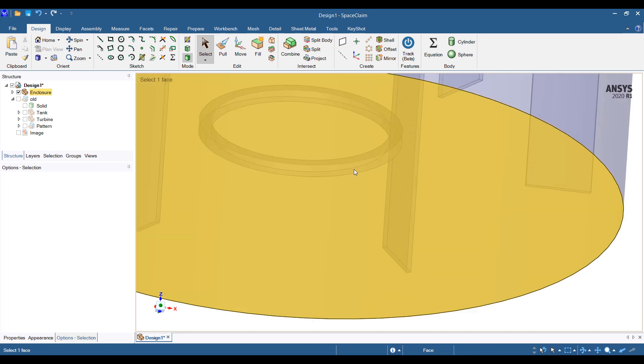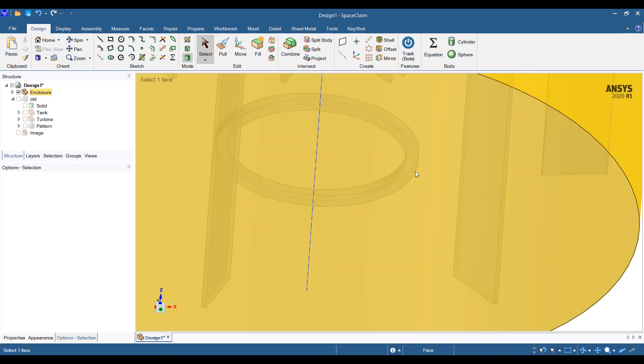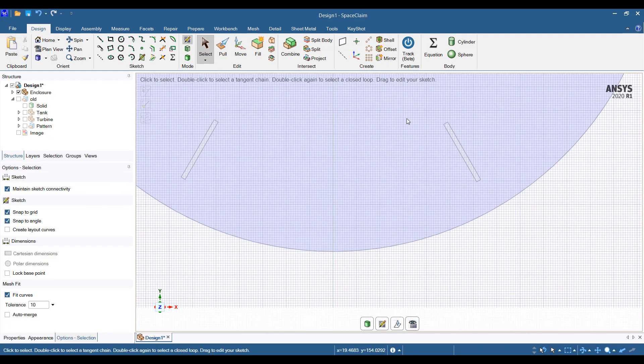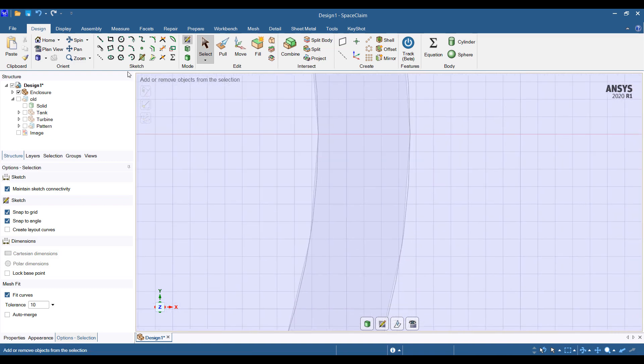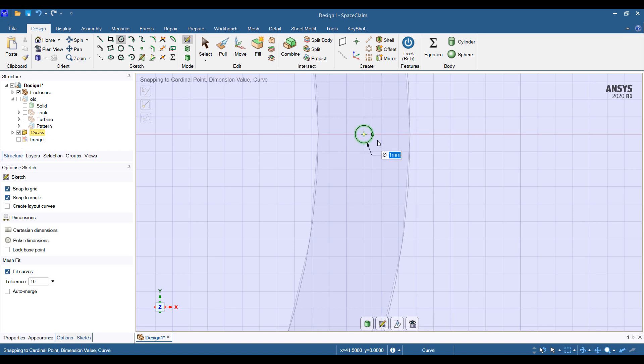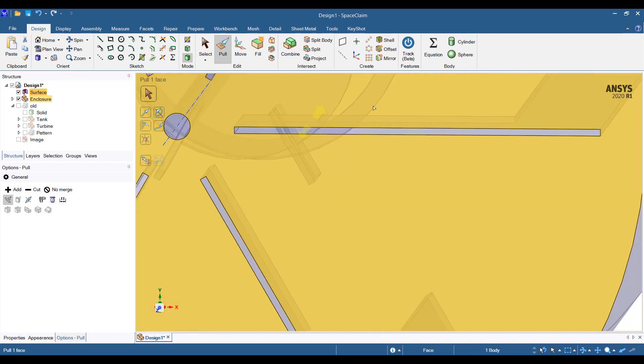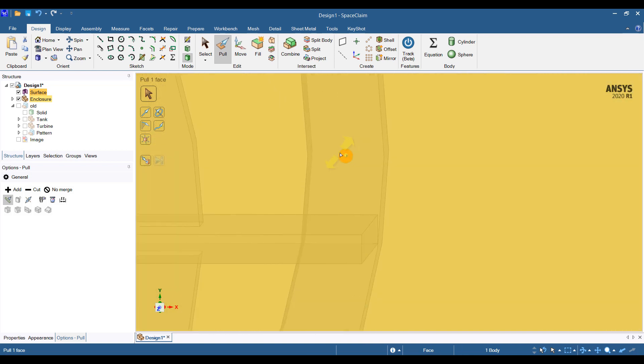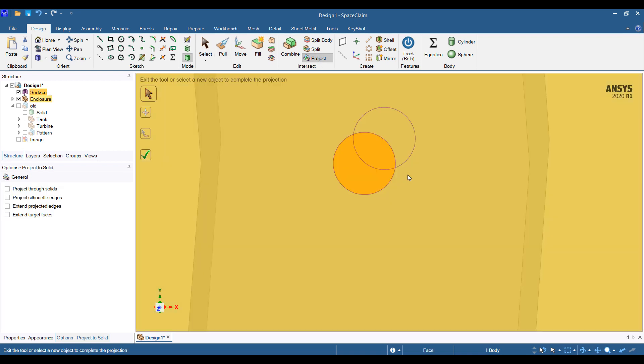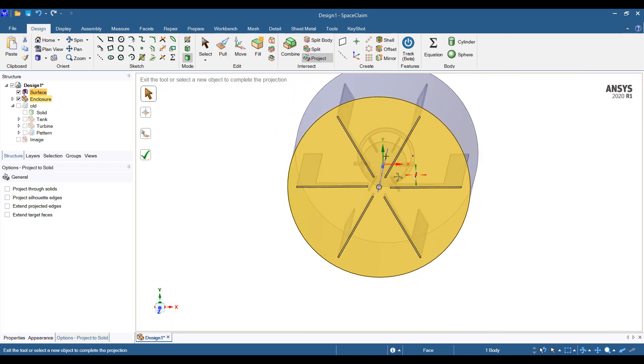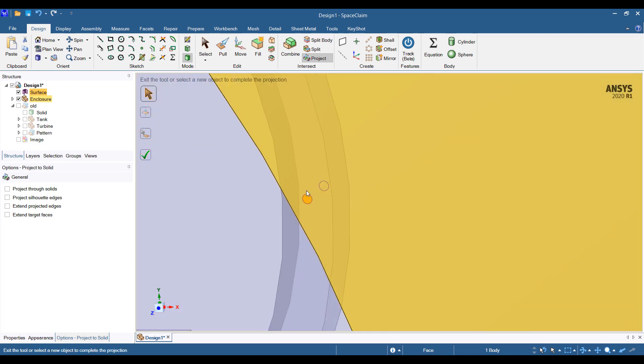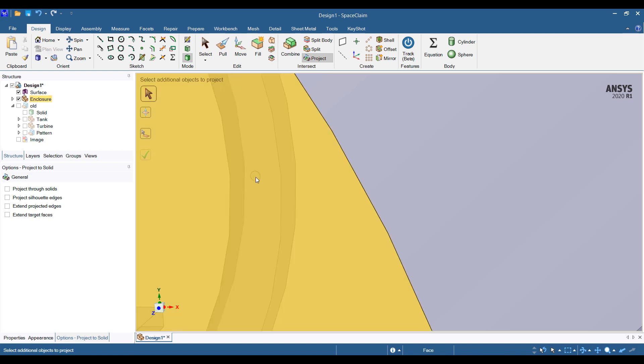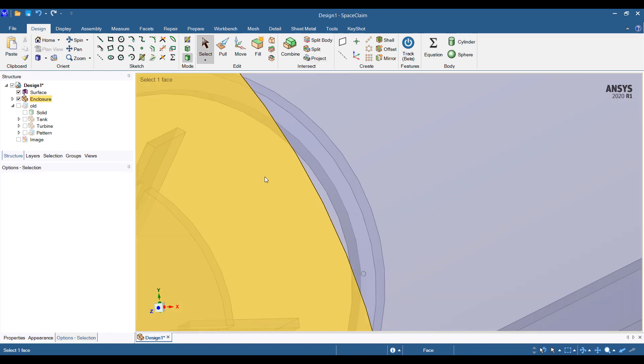And if we click on it it's 140 millimeters almost exactly. So the last thing we need to do is add in the holes for the sparger. We're going to use the control button and sketch on this surface. A sparger is about a millimeter. So I'm going to do 1 millimeter in diameter sparger. So we want to imprint this, project this. So it's projecting this on both the top and the bottom. That's fine because we can just go ahead and do a fill on this. So with the top sparger.